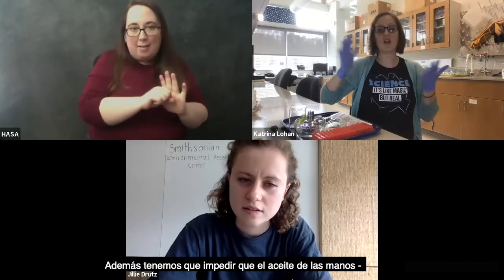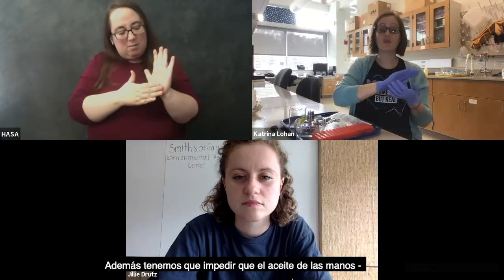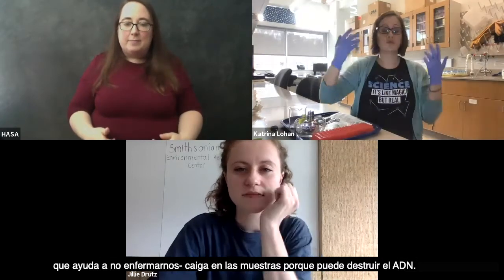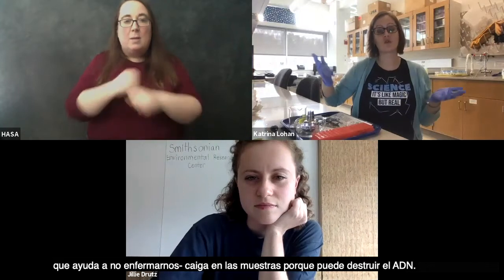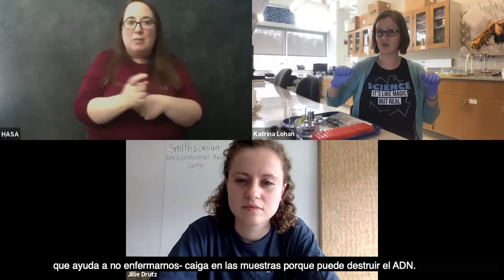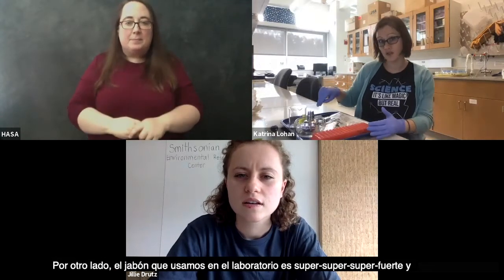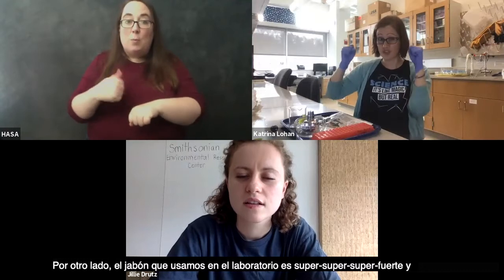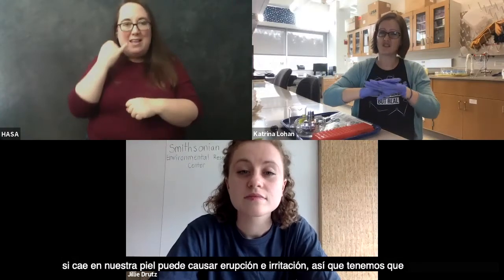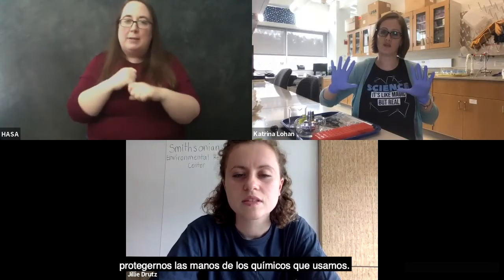At the same time, that oily stuff on your hands is part of your body's way of helping you not get sick. Some of those oils will actually also destroy DNA, so we want to keep them from getting into our samples. And finally, the soap that we use is super, super, super strong soap. If we were to get it on our skin, it can cause a rash and a lot of irritation. So we want to protect our hands from the chemicals that we're using.